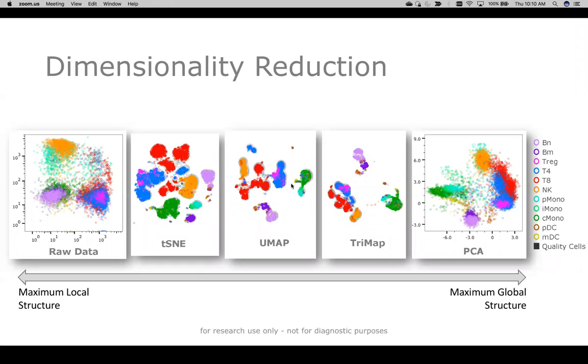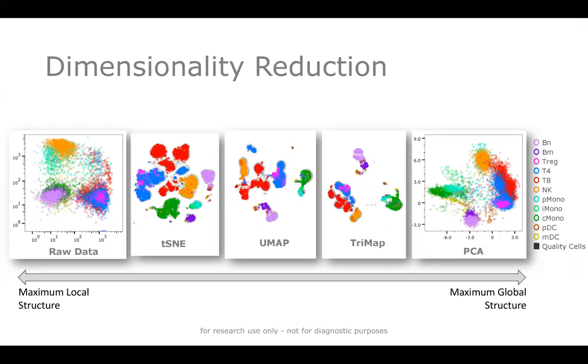Okay, I think enough on TriMap. You guys can check that out for yourself. I'll probably actually run that algorithm when we get into the live demo a bit more.